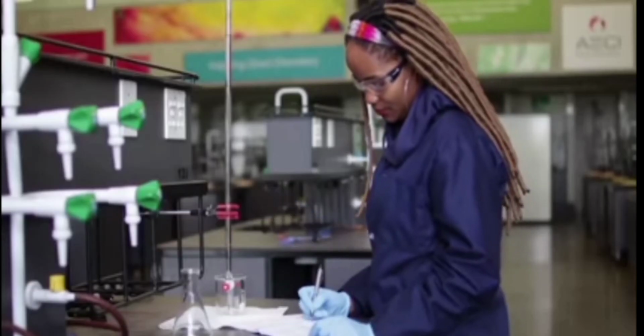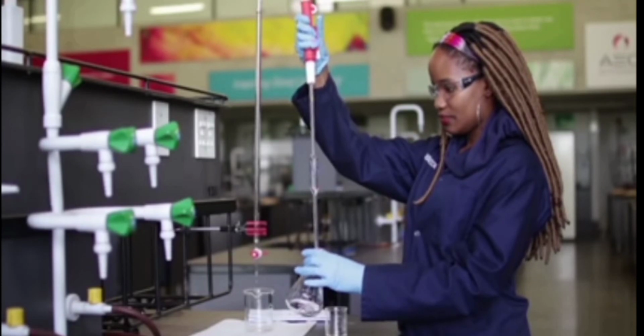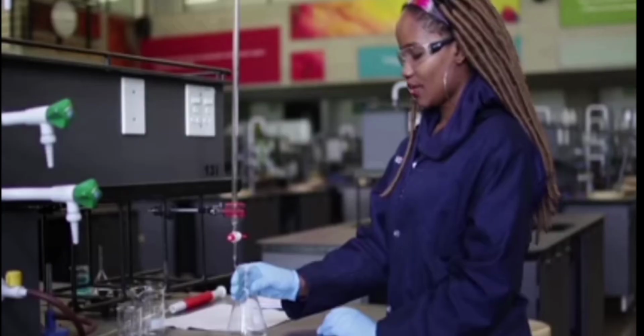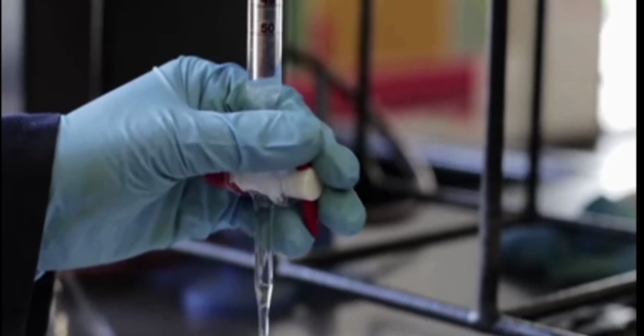The initial reading will be recorded, remembering to do it to 2 decimal places. The analyte solution is pipetted into the conical flask and then a few drops of the indicator are added. The conical flask is then placed under the burette. When performing the first titration, the solution is delivered at a rapid pace to get a rough idea what volume is needed to reach the endpoint.